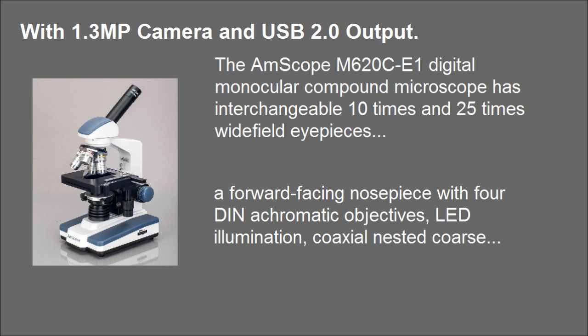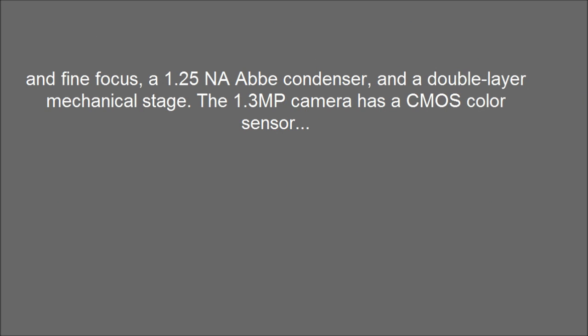LED illumination, coaxial nested coarse and fine focus, a 1.25 NA Abbe condenser, and a double-layer mechanical stage. The 1.3 MP camera has a CMOS color sensor.